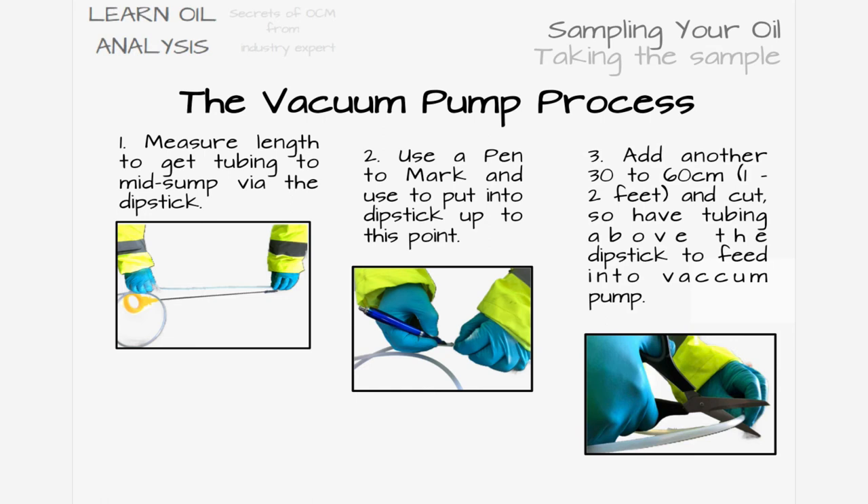Add around one to two feet, or around 60 centimeters, of extra length depending on how close you want to be to the top of the dipstick when taking a sample, then cut this additional length. The pen mark indicates where you're pushing the tube to, not the total end length of the tubing, as you need some spare length to feed into the pump. Make a note of the total length so you don't have to keep measuring against the dipstick, and consider pre-cutting lengths of tubing to make future sampling easier and quicker.